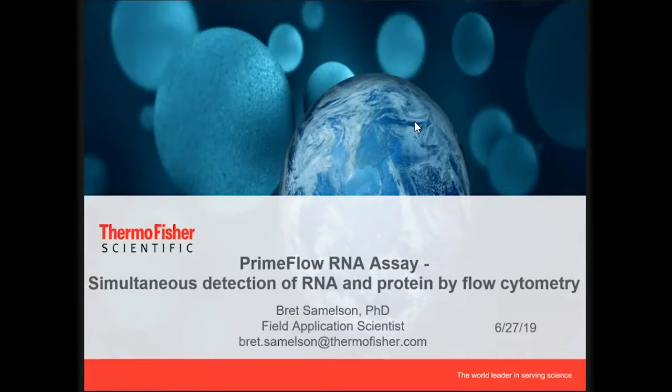So I'll focus my time here on giving an introduction to PrimeFlow, and then you'll hear a bit more on the actual experimental data in the two talks after this as well. PrimeFlow is really an application of the branched DNA technology specifically to be used in flow cytometry. So it allows you to take a lot of the advantages of flow, but combine that with the ability to ask questions about gene expression as well.